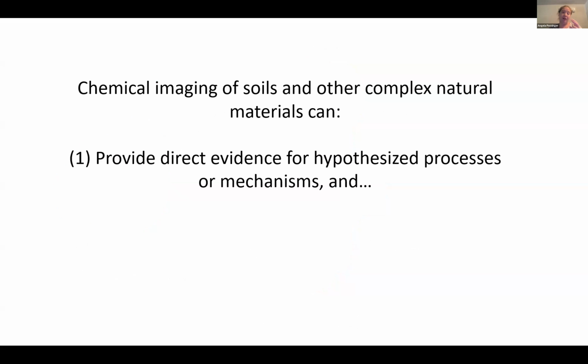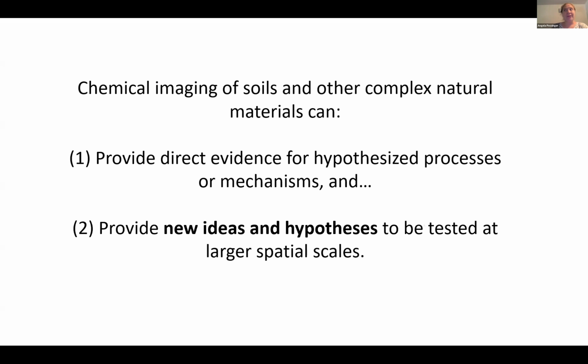So what does this mean for our coming back to these main goals of the value of high resolution imaging? We were able to provide some direct evidence for these hypothesized processes and mechanisms. And also by looking at the specifics of organic matter forms that are present at the interfaces, it provides some new ideas and hypotheses that we can test now on a broader scale.